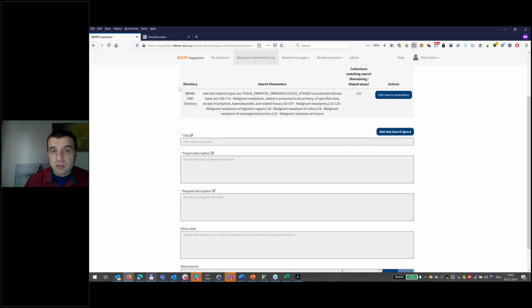Here you can see what the query was that brought you here. I was searching for those two material types and the list of diagnoses, and there are 132 matching collections. And I can provide now, and I'll file it as a test request, so it will not bother anybody.